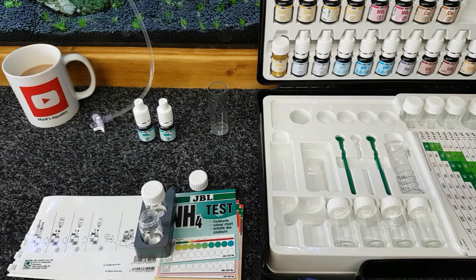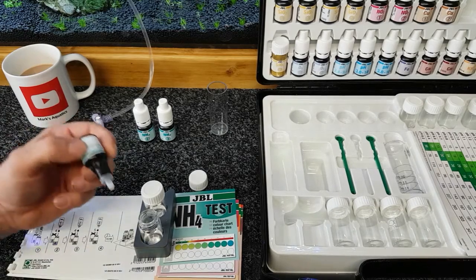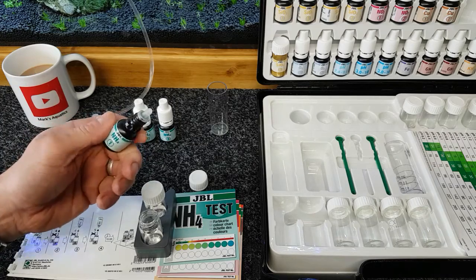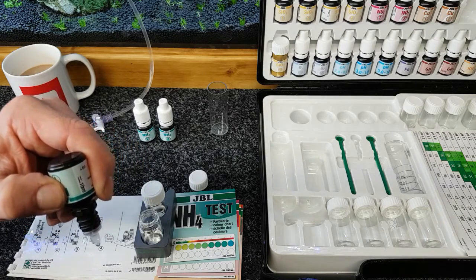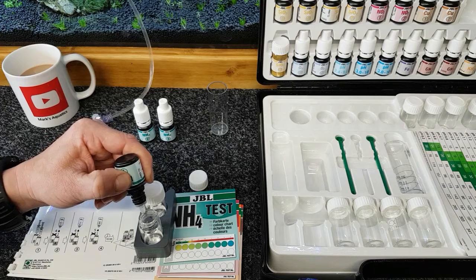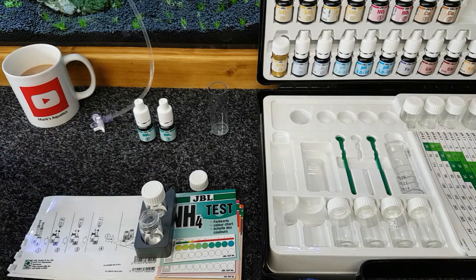Take the top off, and now we want 4 drops of that reagent, NH4, sorry, number 1, into this jar. What I tend to do is I go out first, because sometimes you're going to get a bit of air come out. Just lose 1 drop. Number 4. Okay, so we can put the lid back on that.